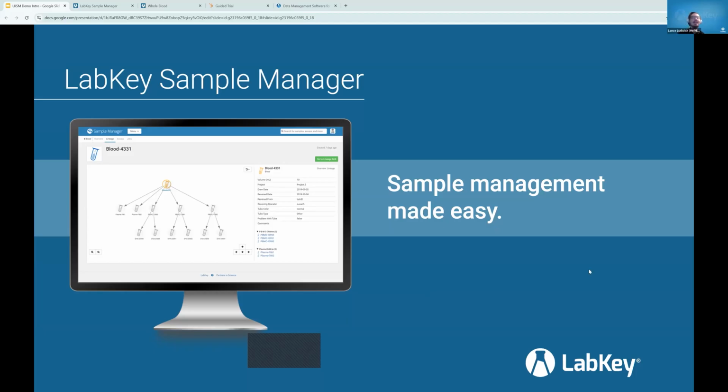But we'll go ahead and get started. So thank you all for joining. My name is Lance. I'm the Senior Product Specialist here at LabKey. I help organizations understand our Sample Manager product as well as our LabKey LIMS product to see if it's the right fit for them and help onboard, implement new software, and be that point of contact for customer support. So I'm really excited to talk to you today about our software Sample Manager.